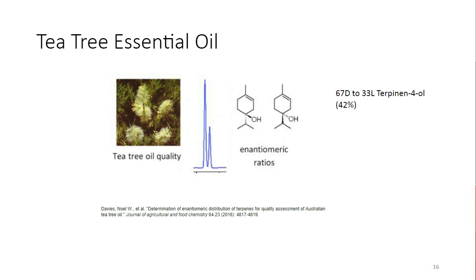And you can see on this paper, from lab to lab, you could see variation from 66% to 69%. It depends upon the way of integration and the sample load. Several things can change chirality to a certain extent, to create standard deviation.